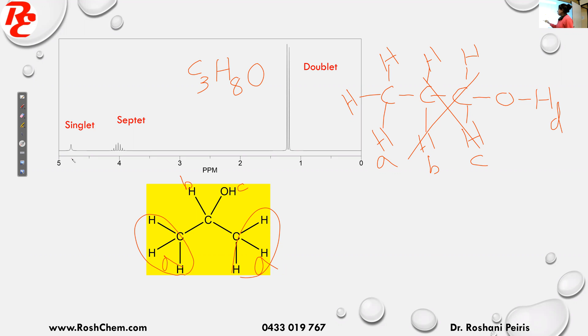And then if you take the hydrogen type A, the adjacent carbon is that, that got only one hydrogen. So then the splitting one plus one, we use the N plus one rule. So I'm talking about these three hydrogens, type A hydrogens. Adjacent carbon is this one. It got one hydrogen. So then one plus one, two. That's why I have a doublet.